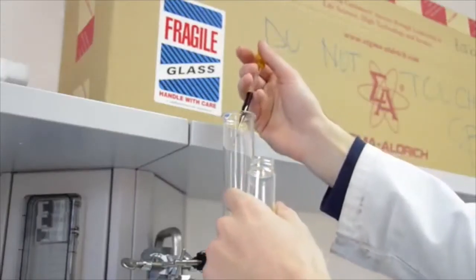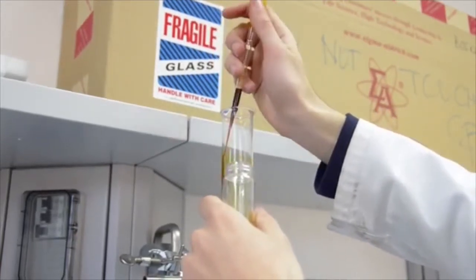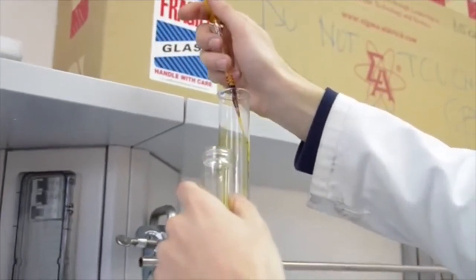Run the solvent down to the surface of the column and close the tap. It is important not to expose the silica to air, but maintain a very minute amount of solvent just above the surface. Using a pipette, gently add your sample to the surface of the column by pipetting the crude mixture along the sides of the column glass.